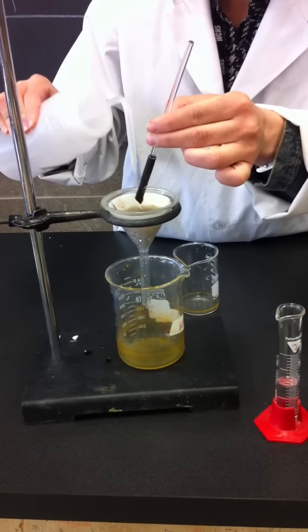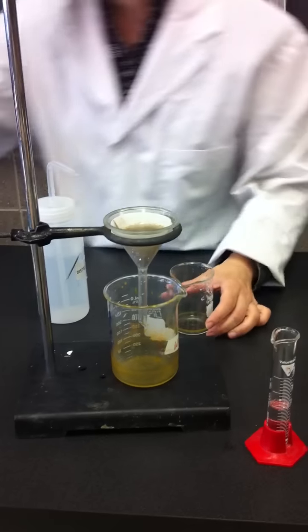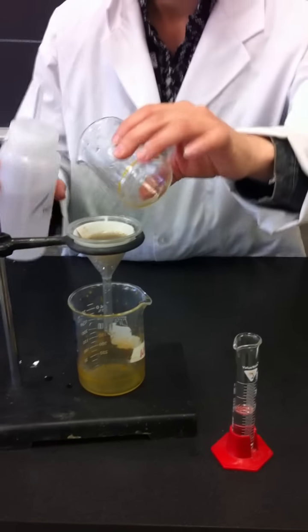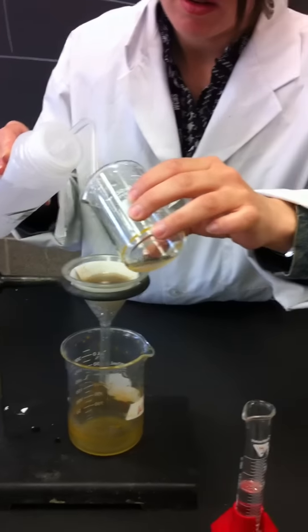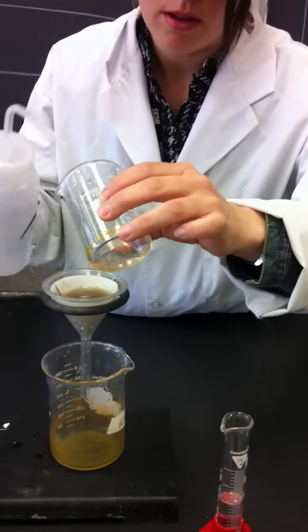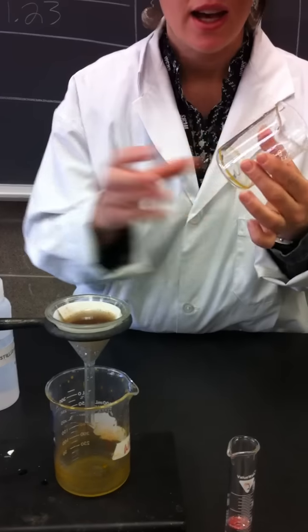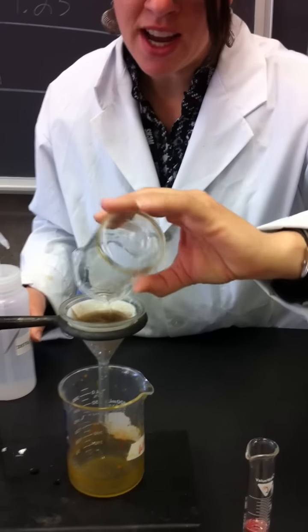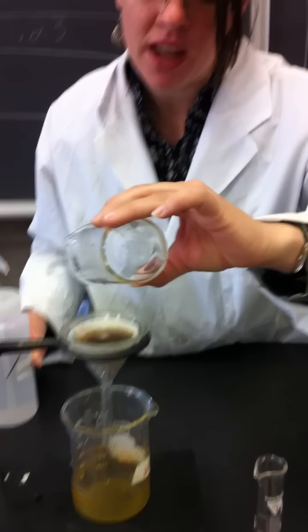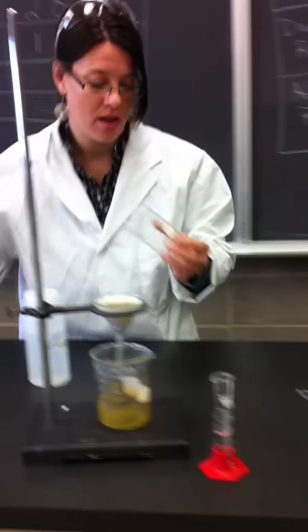So just cleaning all of the materials to make sure you get every last mole of precipitate. So you might clean out the beaker a couple of times until you're satisfied that you've got every last mole, because you want to have a high percentage yield, right? You want to have your theoretical and your actual match as closely as possible.